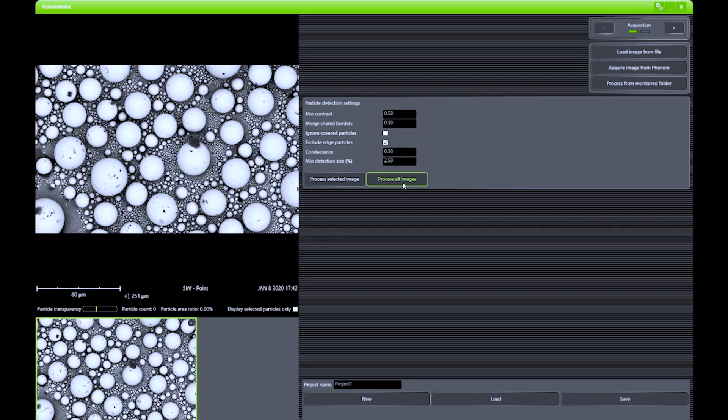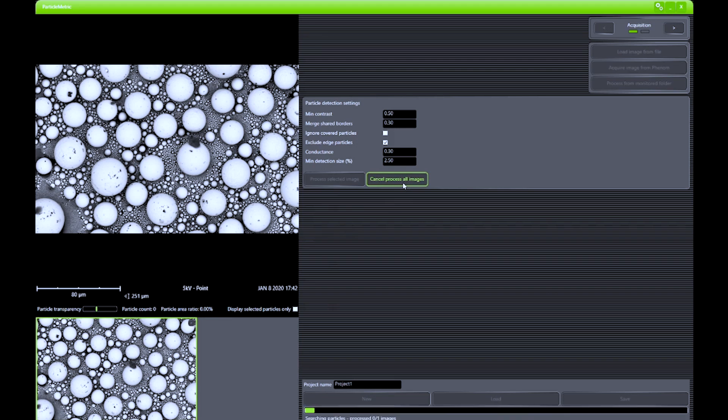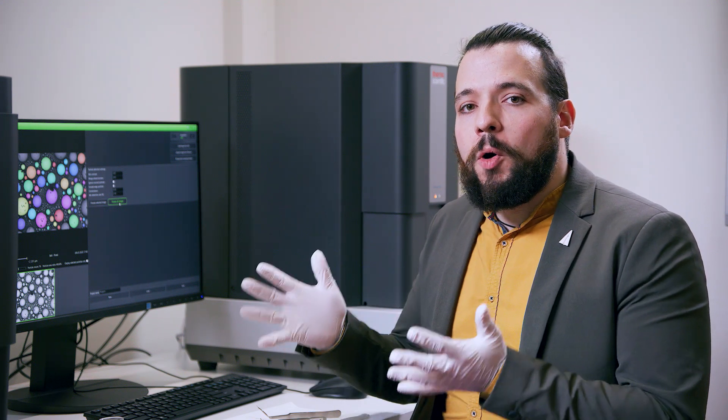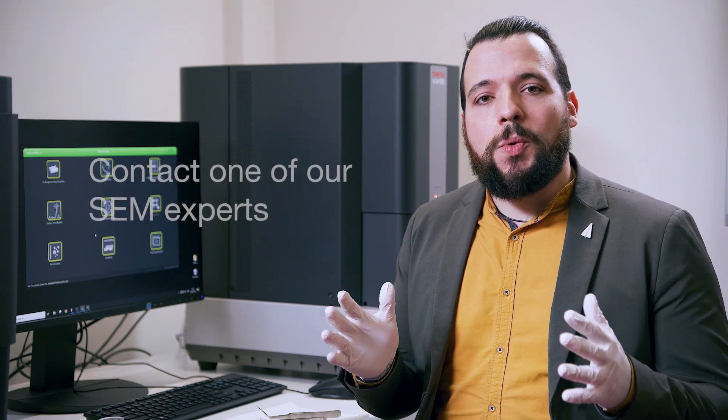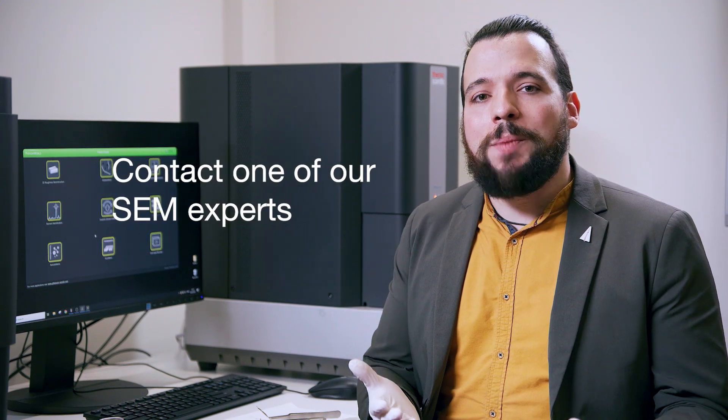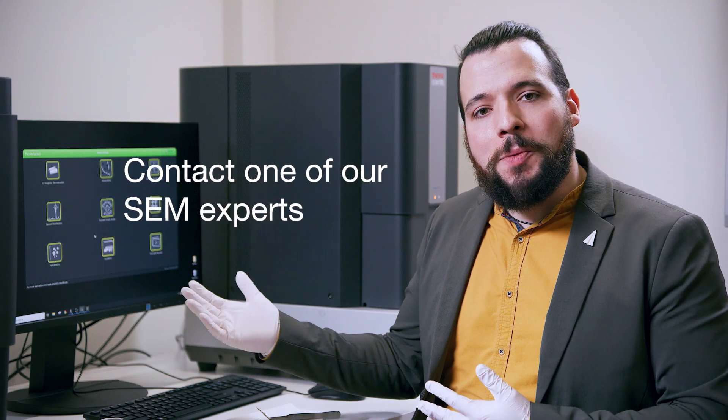Multiple images can be analyzed and acquired by the tool in a completely automated manner, and a report can be generated to resume all the results that were acquired during the analysis. Thank you for joining this demonstration, and if you have additional questions or you want to have a look at your sample inside the Phenom, please contact one of our sales agents in your country.